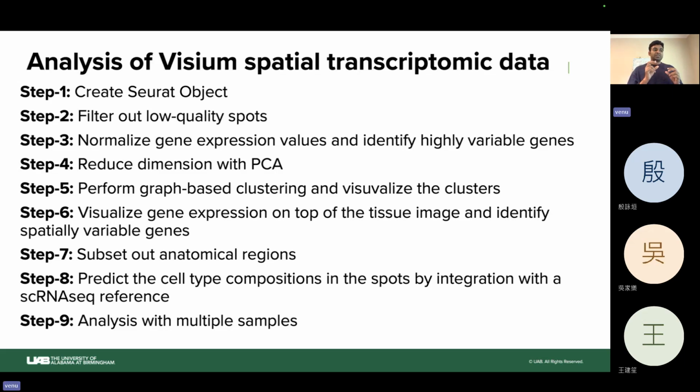Sometimes if an entire spot has only 10 genes, it may capture CD4, which is one of the markers for CD4 T cells. If the expression is very high, it is considered a CD4 cell. But in another spot we may have maybe 10,000 genes expressed, and along with CD4 there is CD3D. These are cell type specific markers. If the number of markers is higher, we can clearly see the spot level expression.